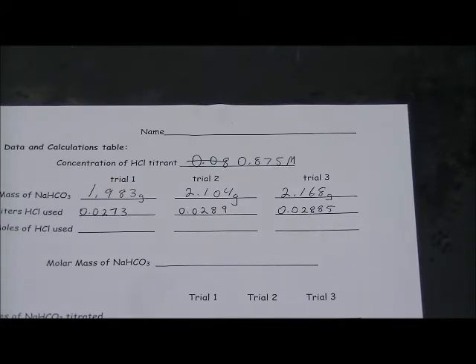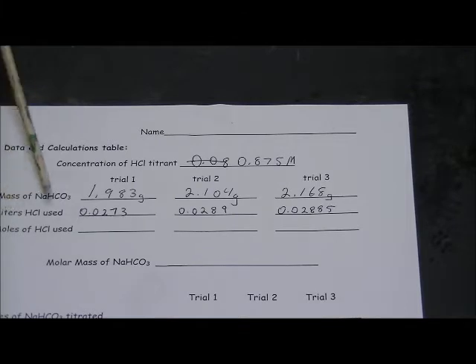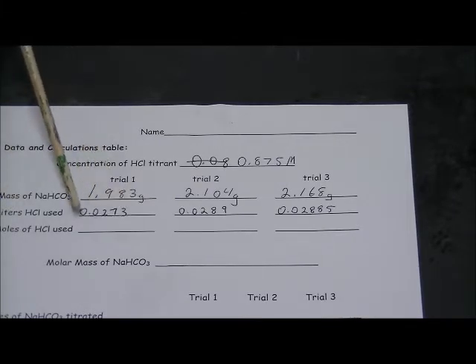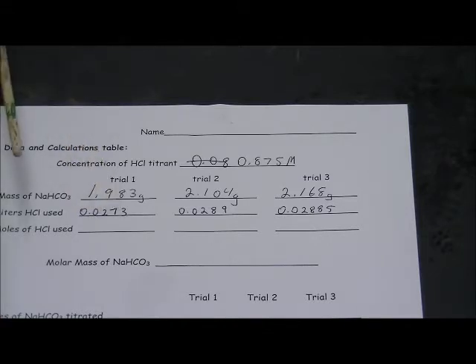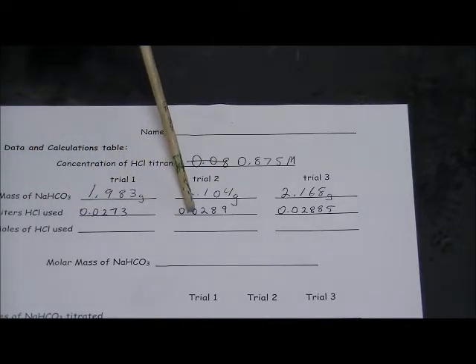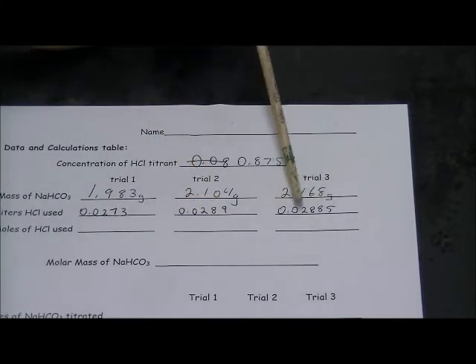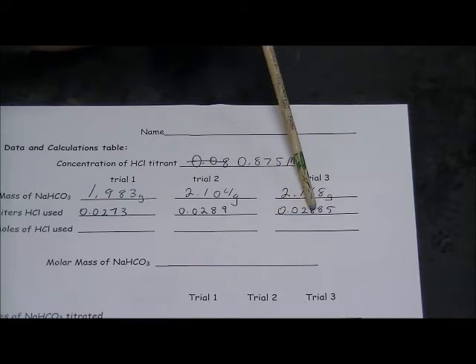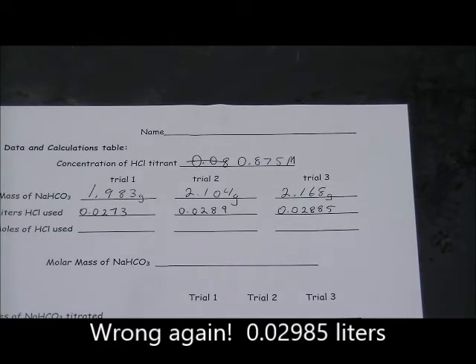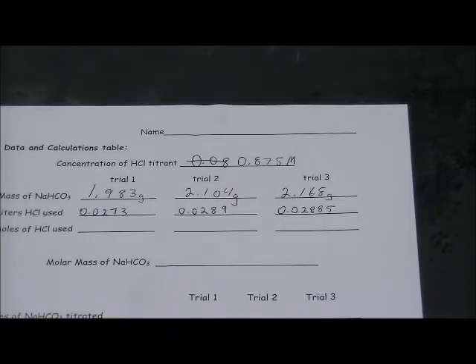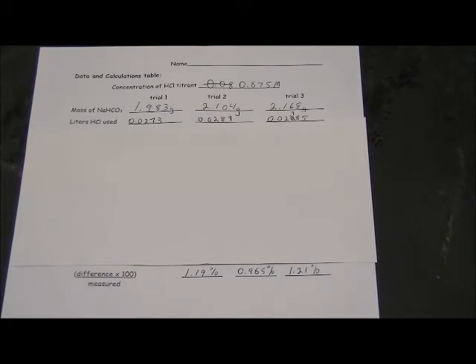So here is our collected data recorded on the data sheet. Note that I converted the milliliters to liters as requested by the worksheet. So 27.3 milliliters is 0.0273 liters. 28.9 is 0.0289. And this last one was 0.02885 liters. So once that data has been collected, you can follow the calculations as described in the worksheet in order to complete this titration. I've blocked off the calculations here to give you a chance to do them.